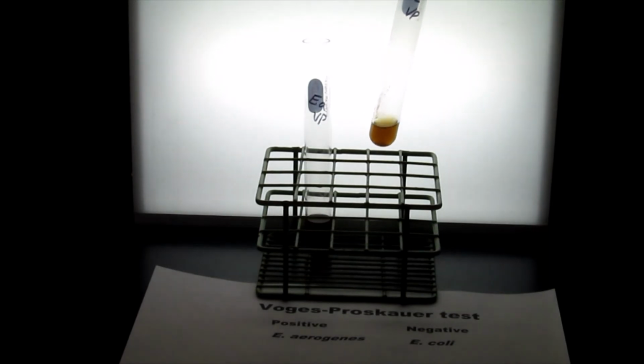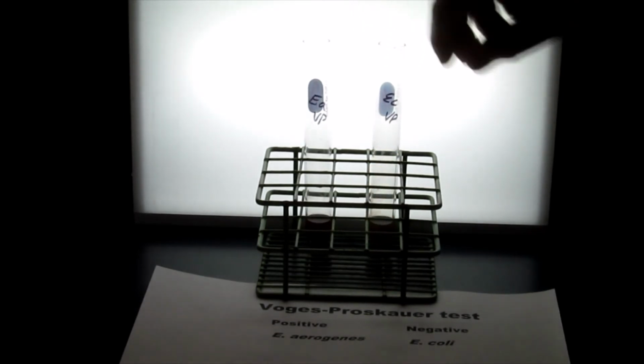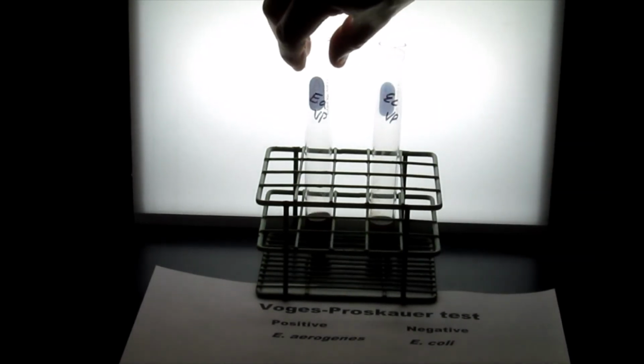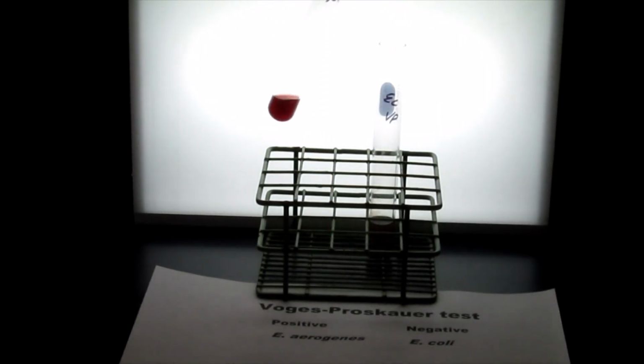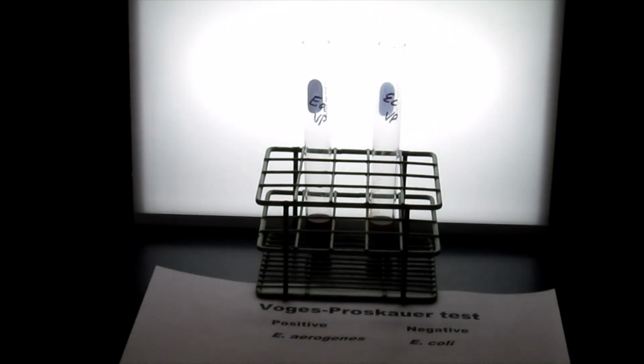We get a negative result, and we get a brown color in the broth. If, on the other hand, you take E. aerogenes, add the VP reagents to the growth of the MRVP broth, you see that you get a reddish broth after adding the indicators, which is a positive result for the VP test using growth in this broth.